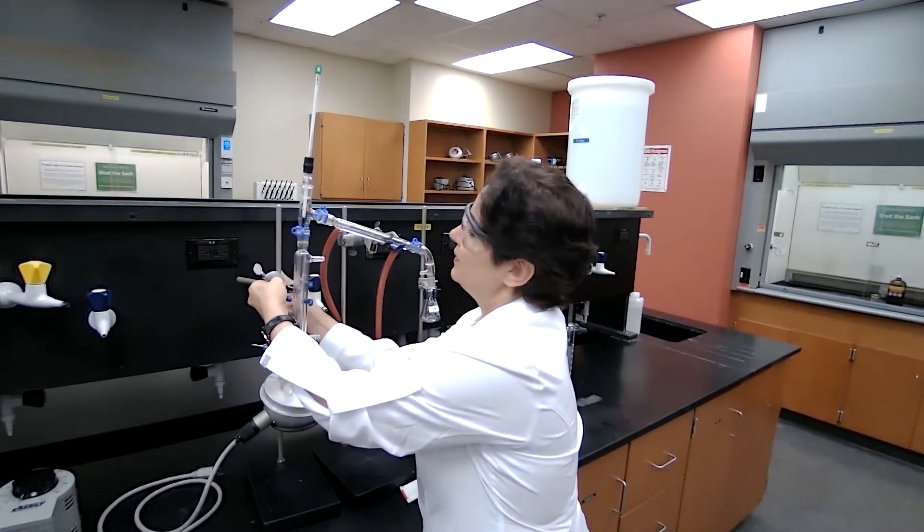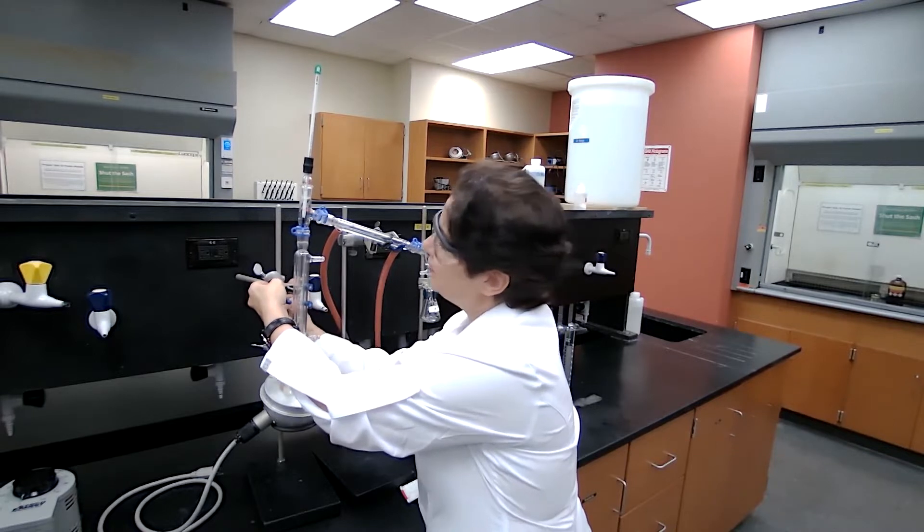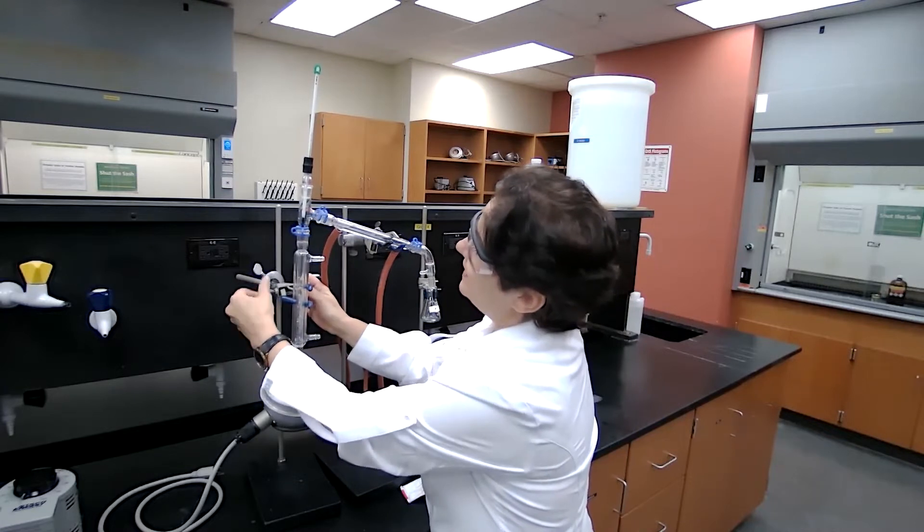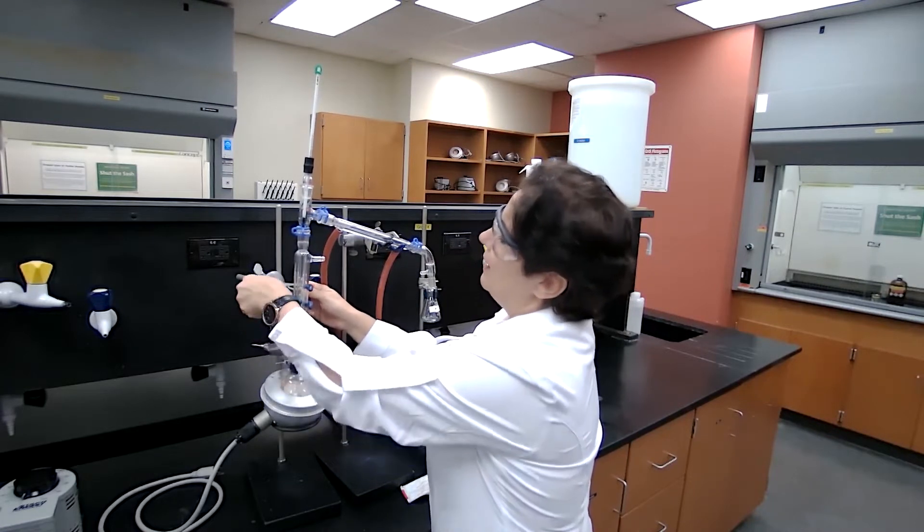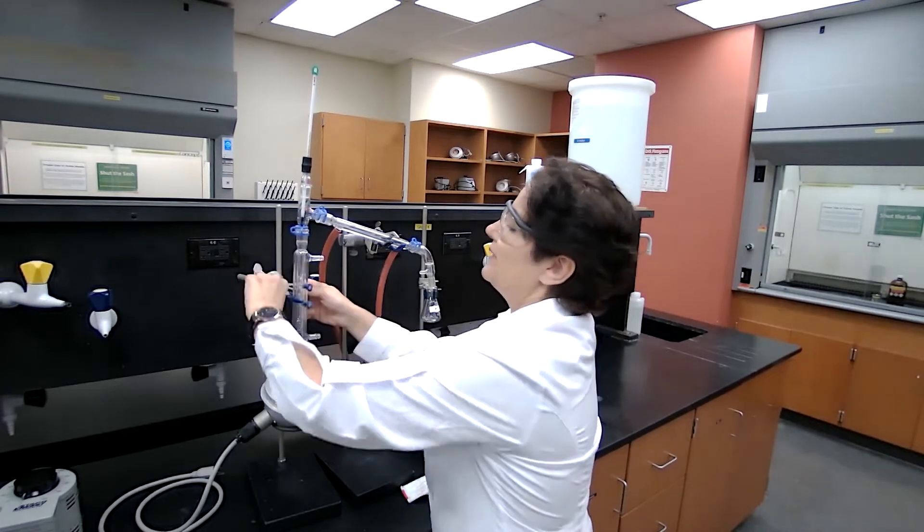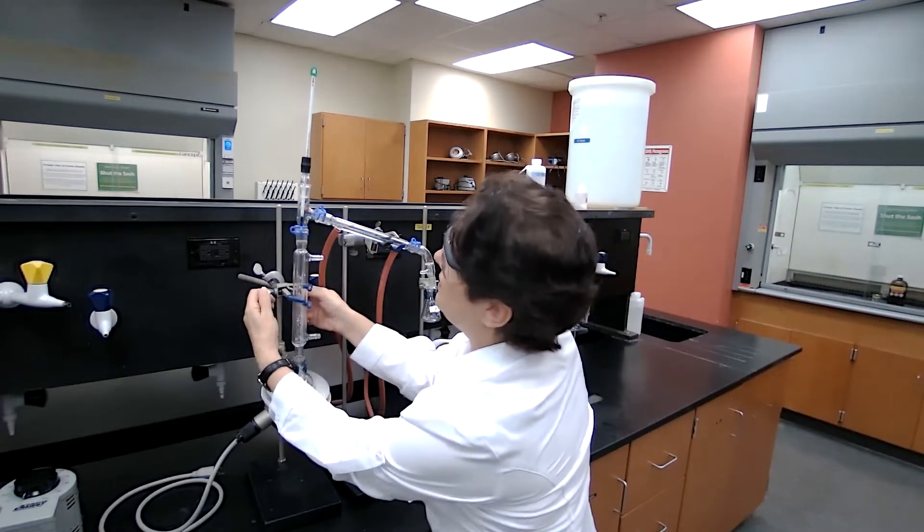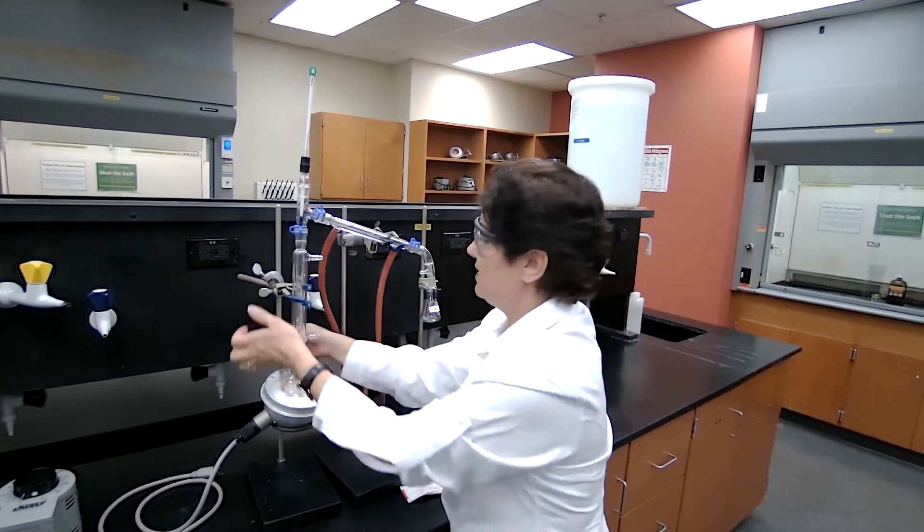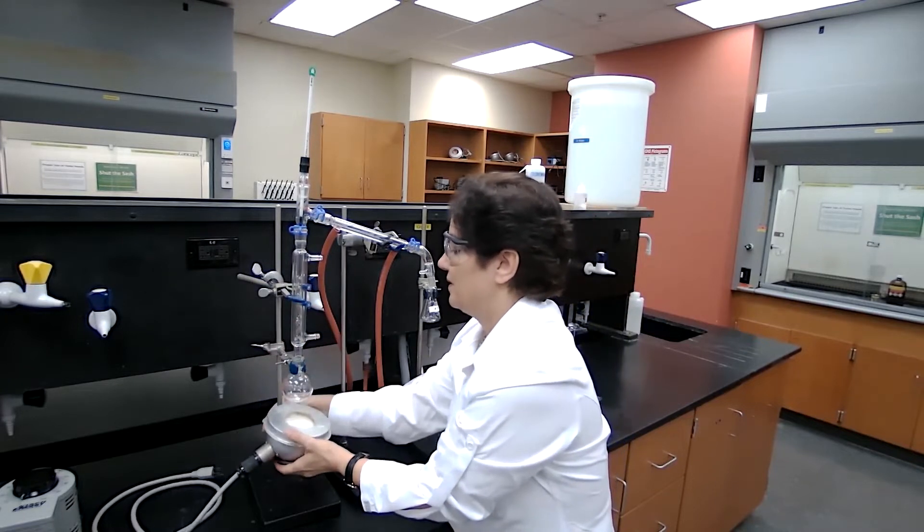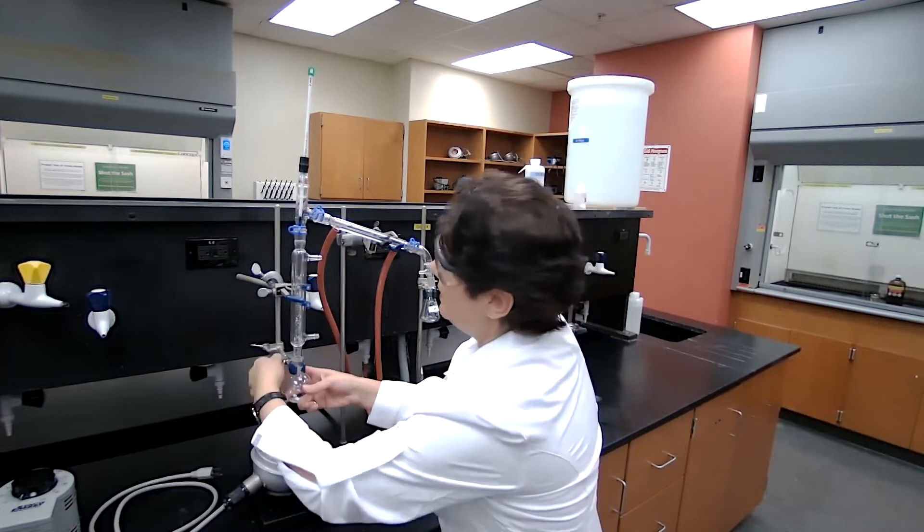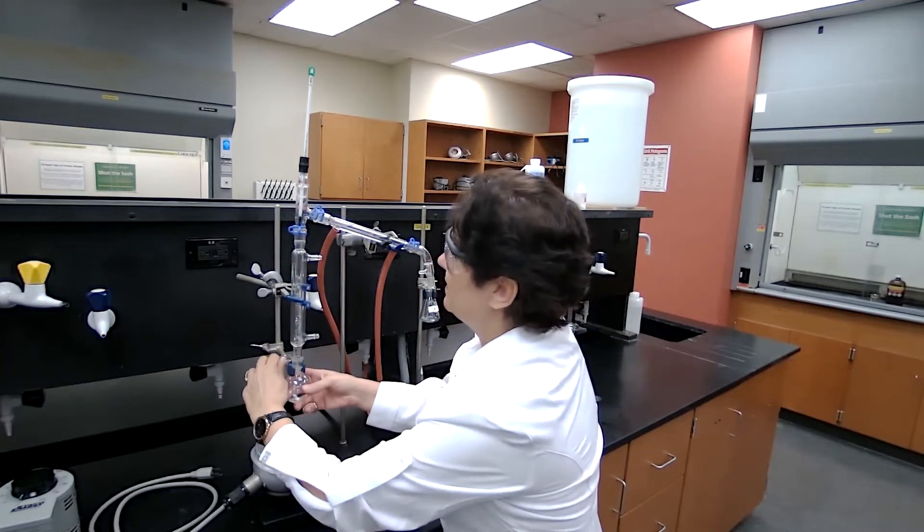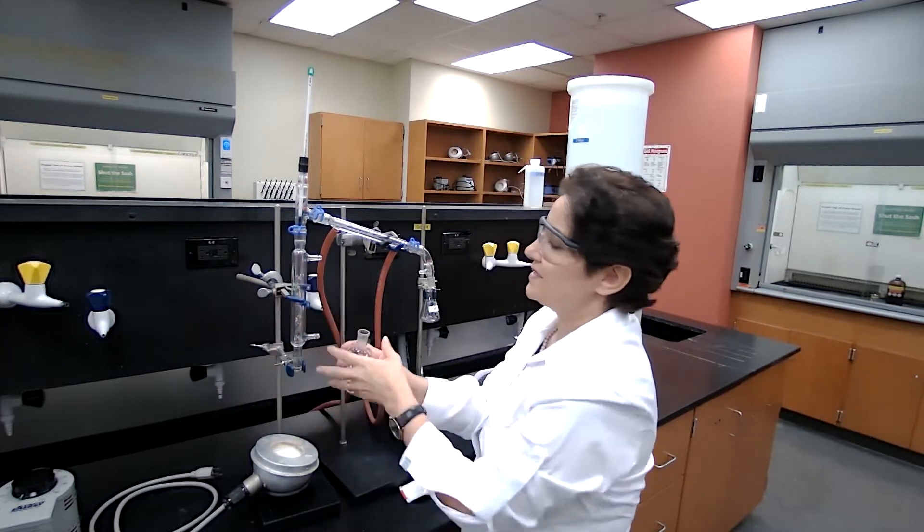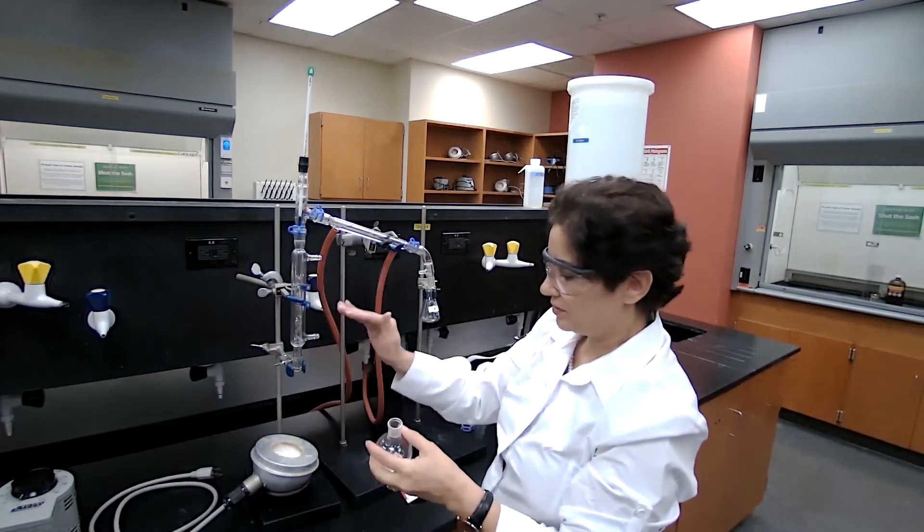We want to make sure this part is secure. So simply use an adjustable three-finger clamp, secure it, and when it is secure, now you can confidently open this part, lower it, and remove the flask. Remove the flask, this is secure already, it's not going to drop.